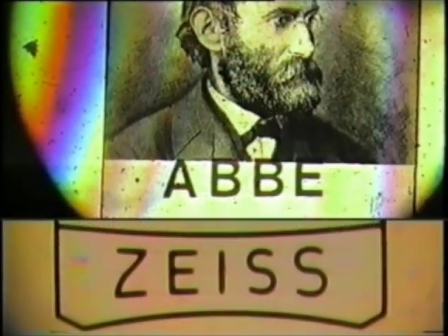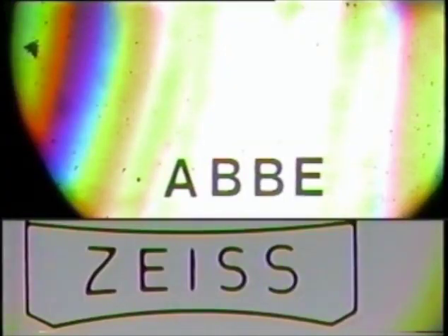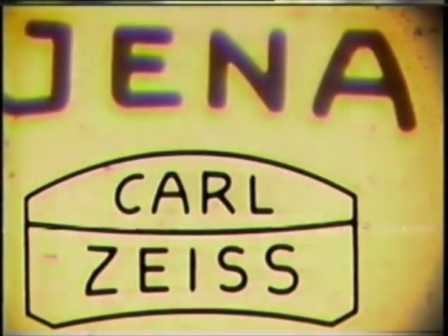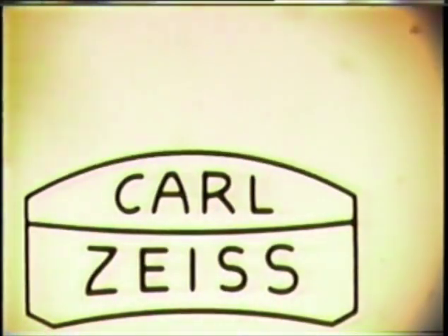Well, to move on to the experiments, I'll take Abbe out of the back focal plane, turn the light down a little bit for the moment. I'll leave his name just for the moment. Take Jena away, take Carl Zeiss off the stage, and replace Carl Zeiss as the object with a series of lines, a diffraction grating in fact, which we're going to use as the object, the specimen, for these experiments.